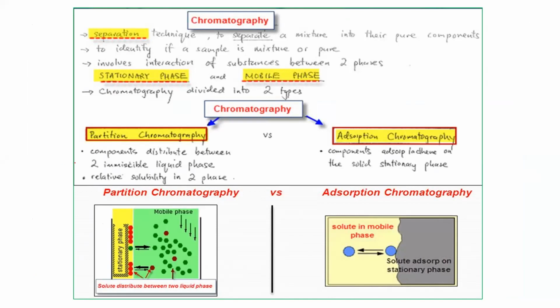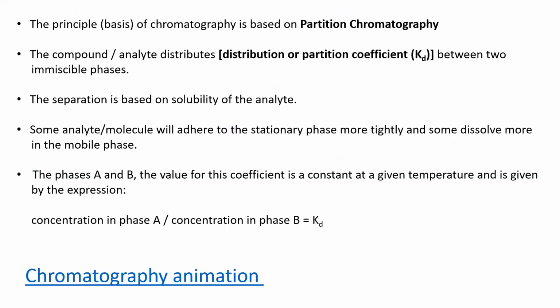One type of partition chromatography is liquid chromatography, and we have already seen that. That's why I will now explain liquid chromatography and the other type of partition chromatography, which is gas liquid chromatography. So the principle or the basis of any chromatography is actually based on partition.